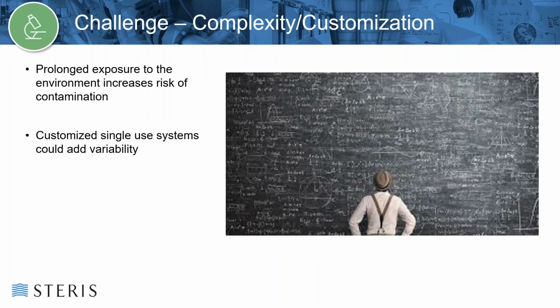Additional challenges from complexity of devices is that the more complex a device is, and a large number of tubing pathways that need to be organized in the testing environment, there is an increased or prolonged exposure of the sample to the environment. Although it is a clean environment, there is still some potential of contamination when you're working in a clean room. So there is an increased risk of contamination the longer that sample is exposed for complex devices.